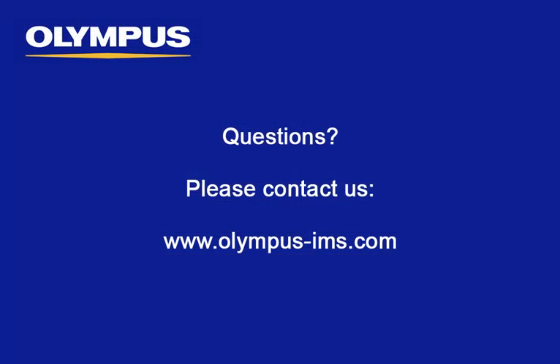In this instructional video, we have covered count and measure with particle separation within the Olympus Stream image analysis software. We hope this video has been beneficial and we invite you to contact us directly with any questions. Thank you.